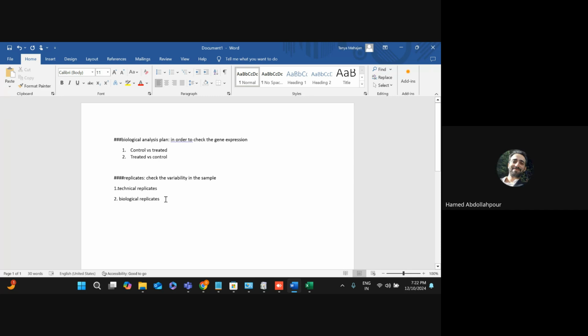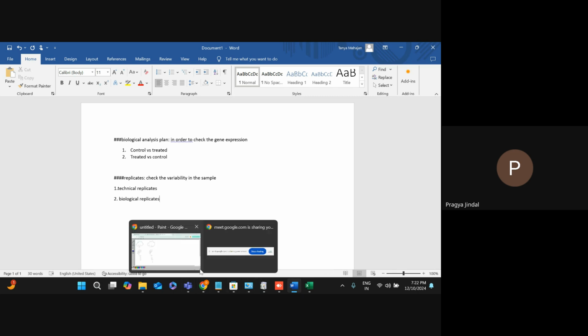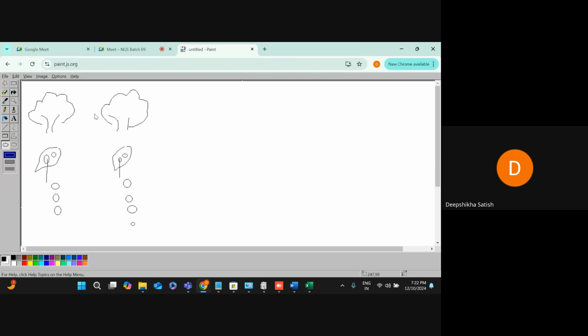Yeah. No, ma'am. Please, can you repeat? Ma'am, in the biological, you are having two different plants. Can you see the two hibiscus plants here? From this plant A, I have taken the cell. Here you can see it has been taken from tree 1, and this is my tree 2 here.